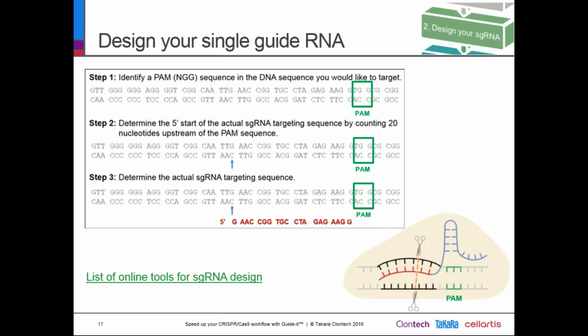It might also be good to use different tools, because all these tools use different algorithms, so that you can check whether your favorite guide RNAs that are the best ones in one tool also have good scores in another tool.